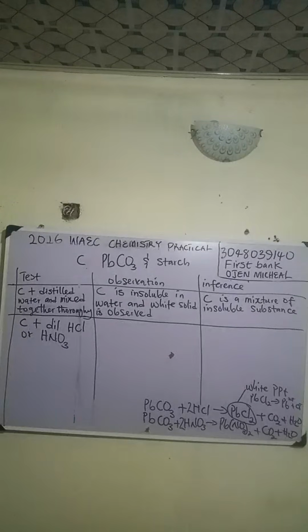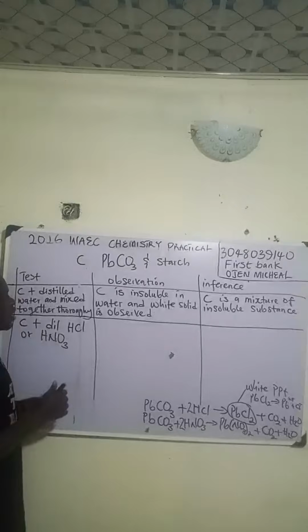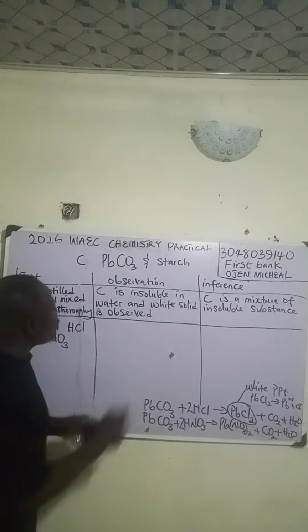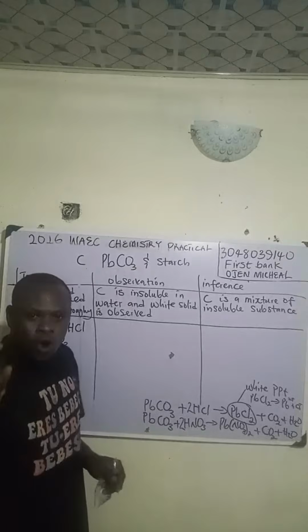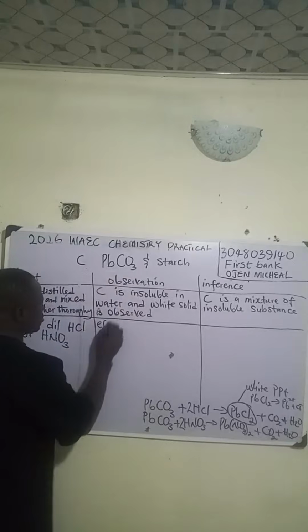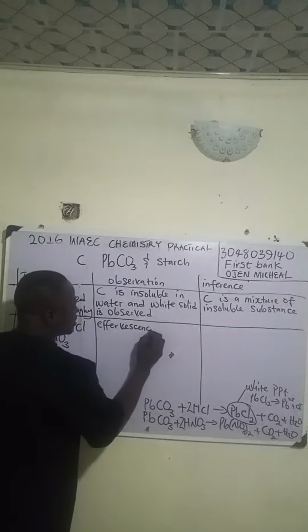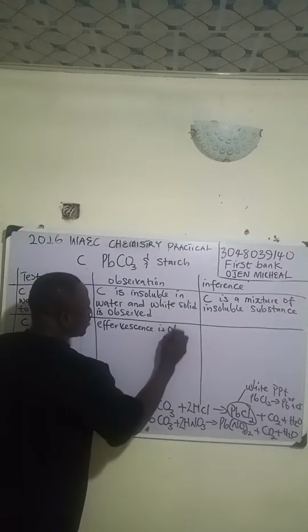Yes, they are going to give you the instruction. So now, when you put this one down, what you are going to see is, because of the presence of this carbonate, effervescence will occur. Effervescence is bubble. Bubble will start to come out. So you see effervescence. Effervescence is observed.